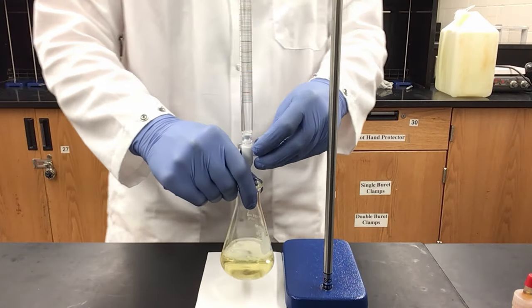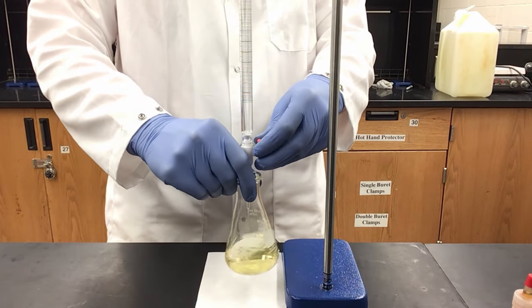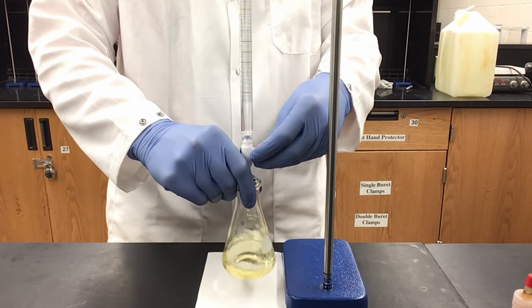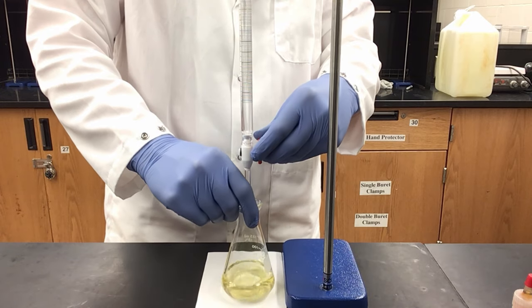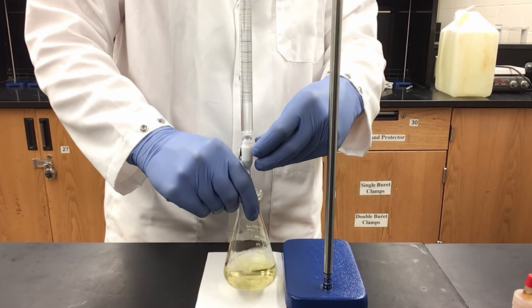Since I am now nearing my 30 mL estimation, I am slowing down and waiting to see a significant color change, adding my solution drop wise.